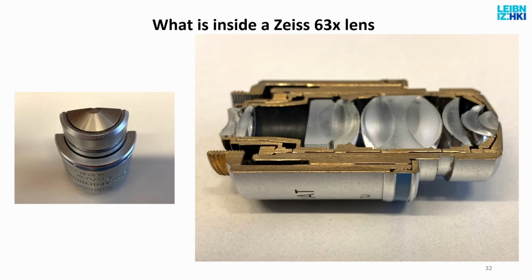And this also means that if you damage your lens and it has to be repaired, then it can only be done by a specialist. So it has to go back to the manufacturer, for example. And then what they do is they open this lens up in a clean room, so there is no dust in the air, and they wear space suits.